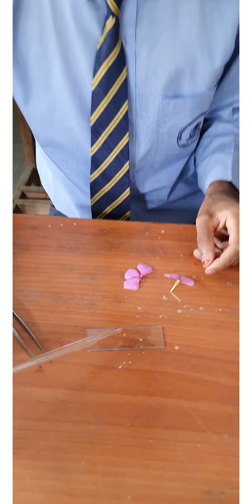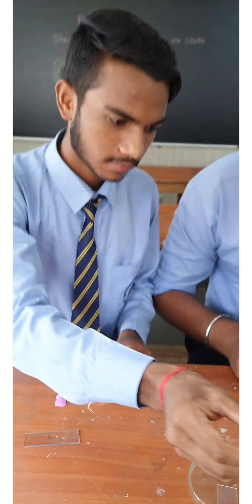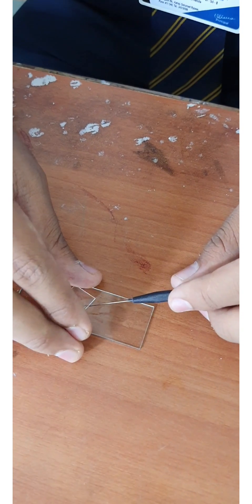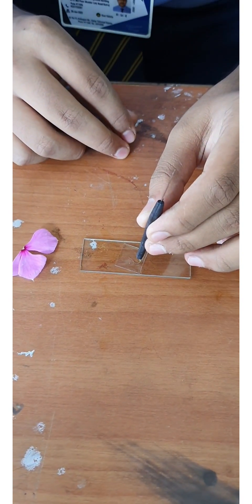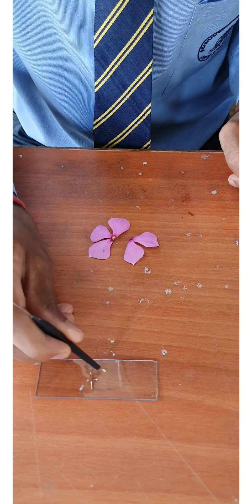Now take a few drops of sugar solution on the anther. Place the cover slip very carefully. Tap the cover slip gently using a needle so that the anther becomes open and lets the pollen grains release.